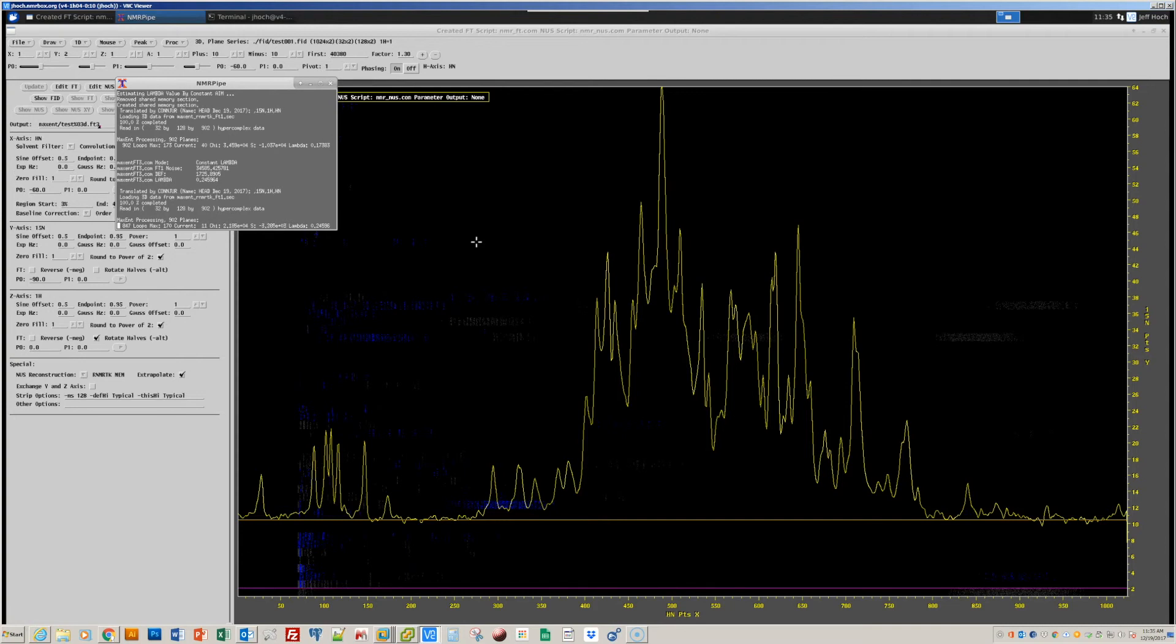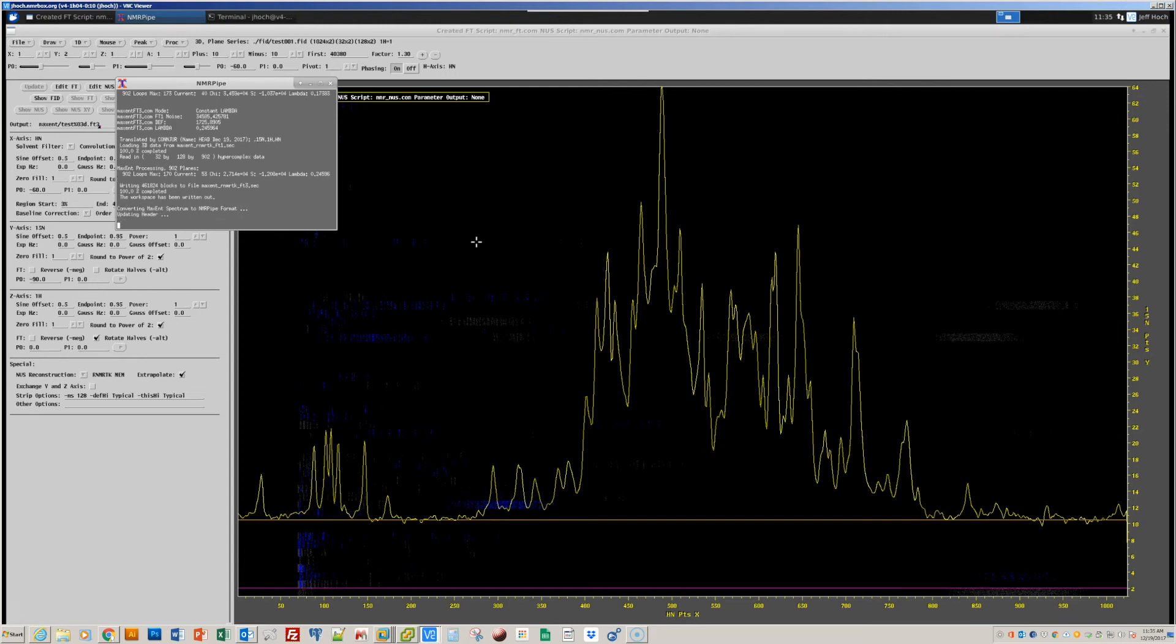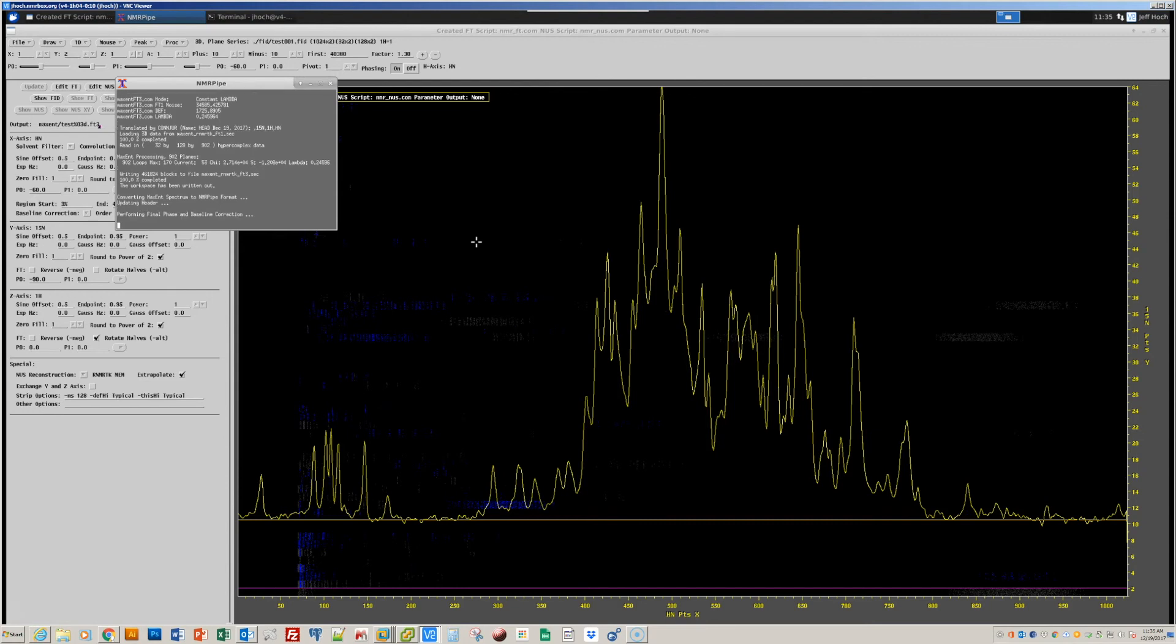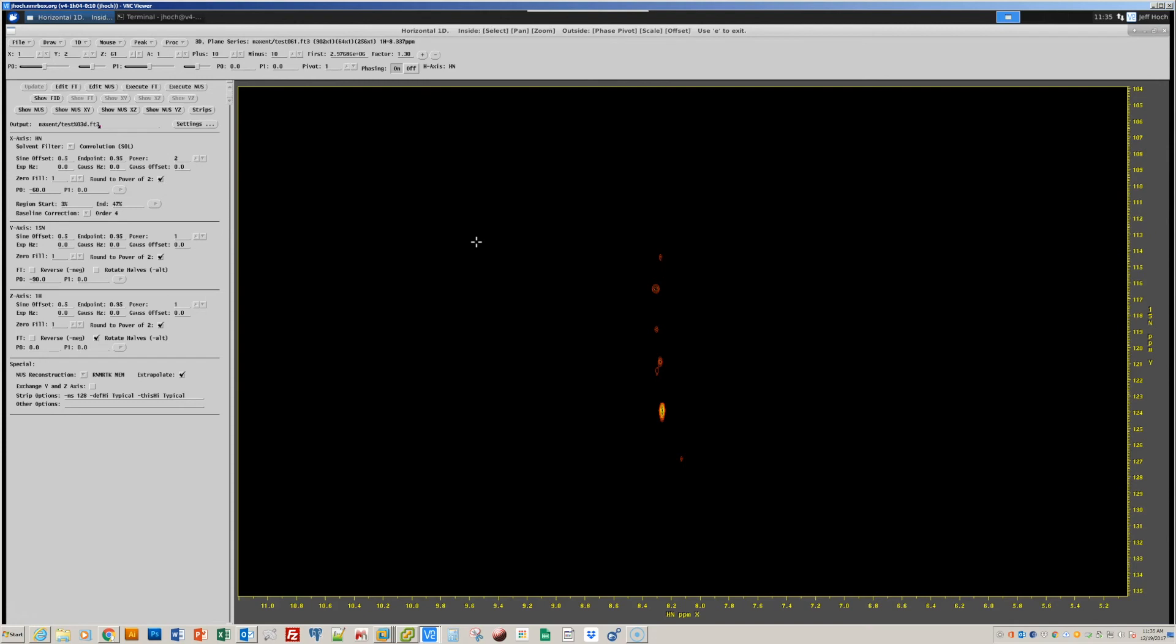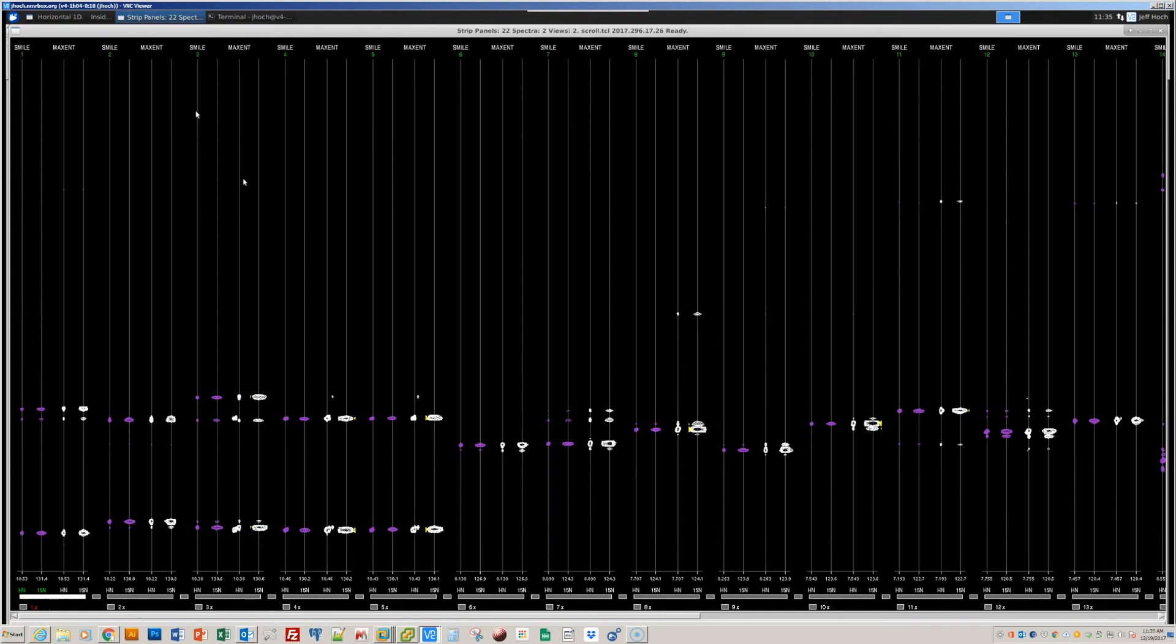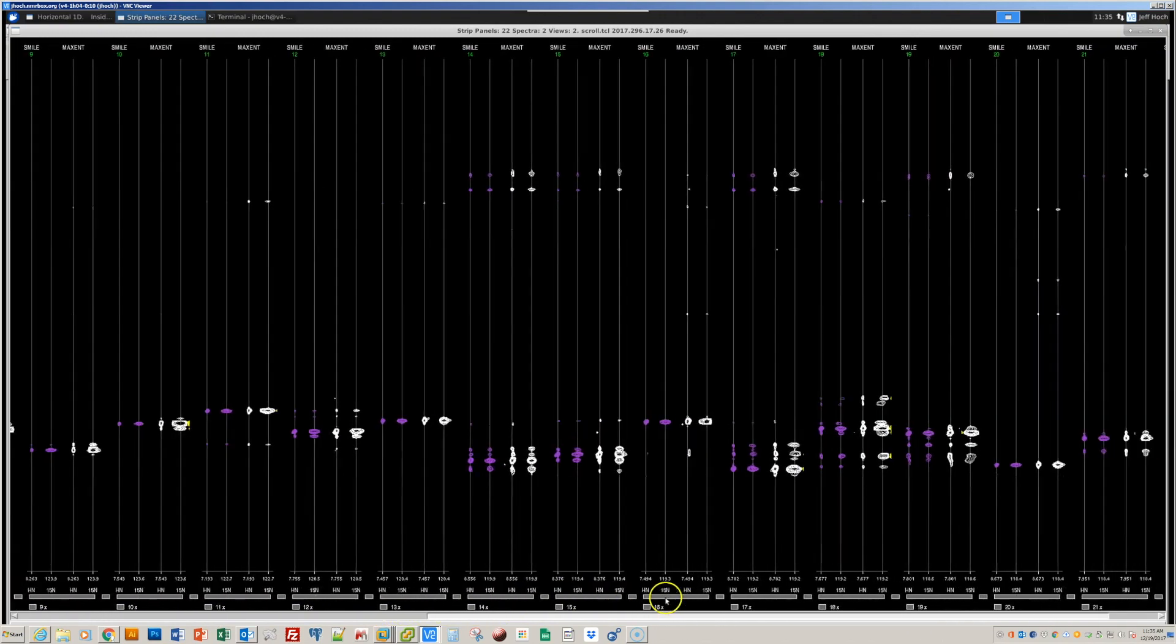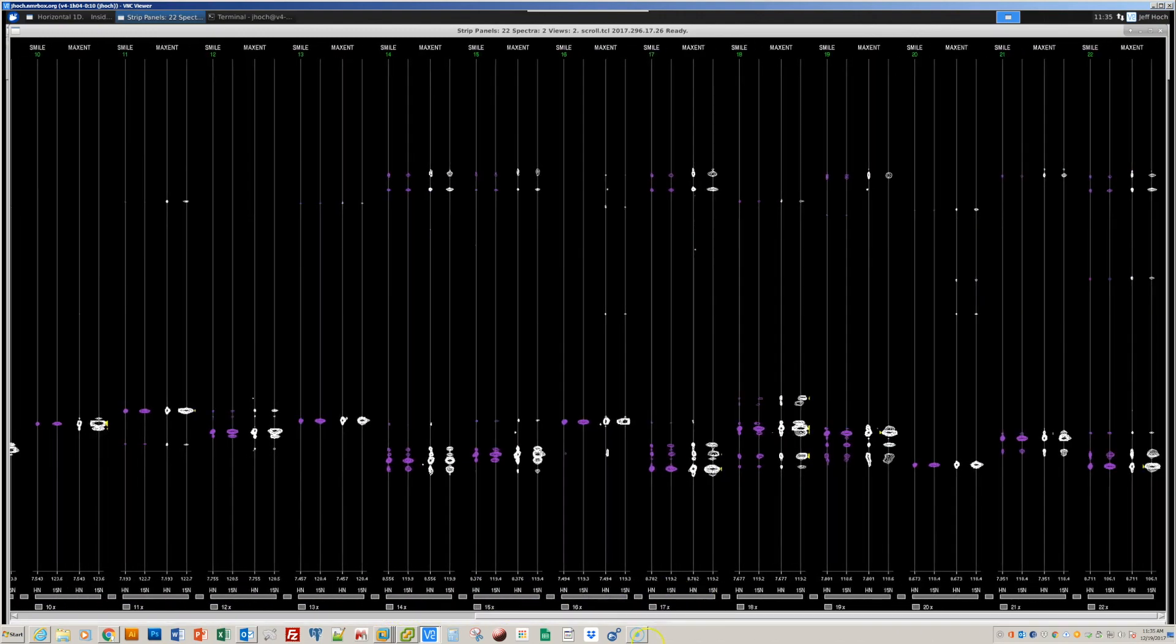And now that that parameter lambda has been determined, we're doing a complete reconstruction on the data, which finishes very quickly. And now we're converting back from the Rowland NMR Toolkit format back into the NMR pipe format. And here on 3D results, this time I press the button to display strips. We'll see the new maximum entropy result side-by-side with the previous result that we generated with the SMILE reconstruction technique. Simple and beautiful.